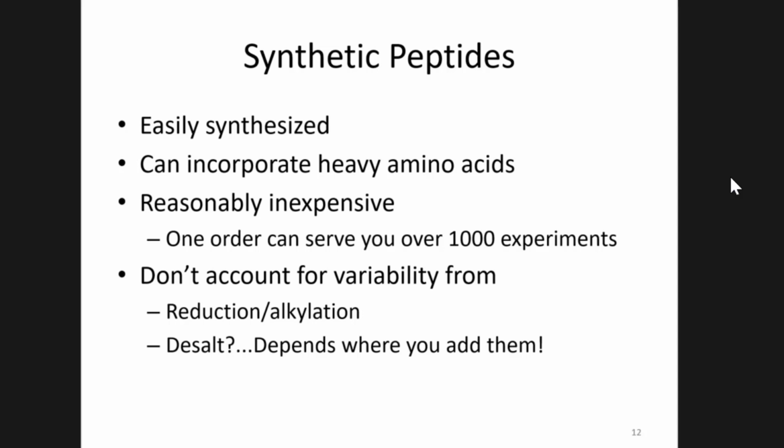So I would evaluate on a per peptide basis, spiking it in during digestion, like with the trypsin, because you need to understand the peptide stability. And so this goes to what Lindsay was talking about, or did you talk about it yet? A little bit. Yeah, stability of your standards can be studied, and you can get information about stability of your analytes from that. So if you put it in with trypsin, but it somehow gets cleaved or modified or falls apart, then you wouldn't want to do that.